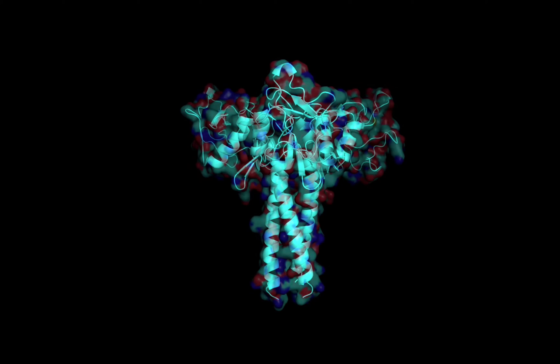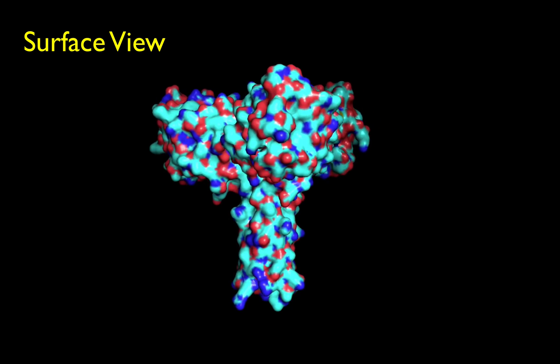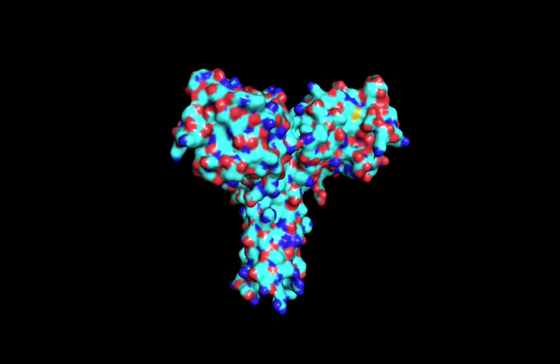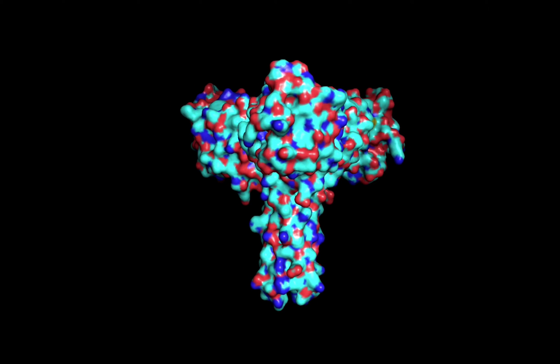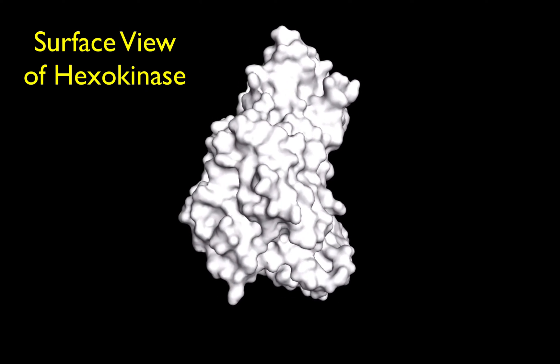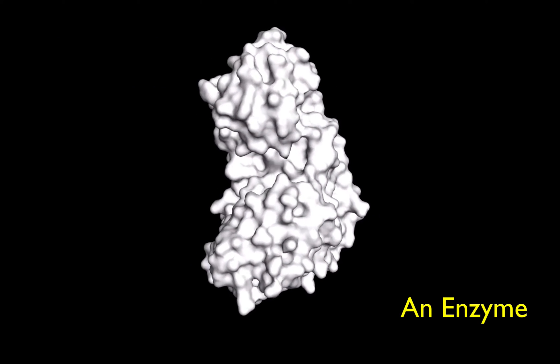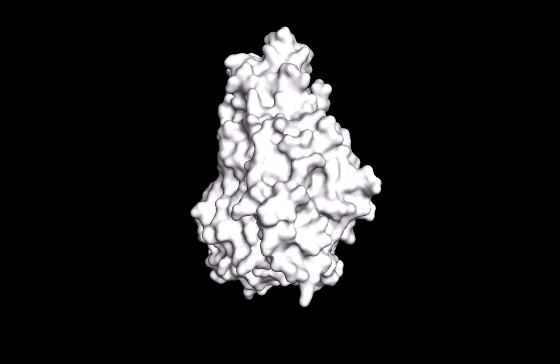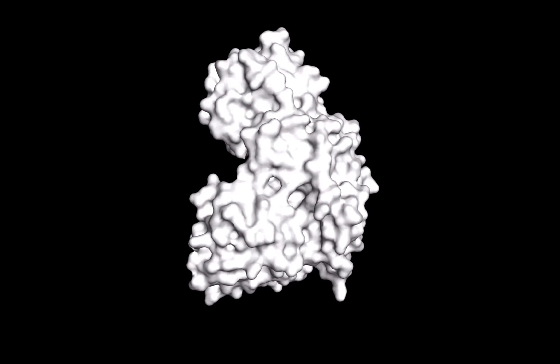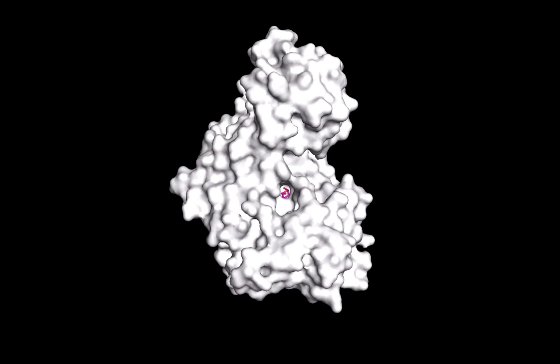Another very common way to render a protein is by showing the surface. This traces the outside edge of the protein. Notice in some spots on this protein there are little holes where there are no amino acid residues, and this makes a gap. Let's look at an enzyme in the surface view. Here we're looking at hexokinase, the first enzyme involved in the process of breaking down sugar in your body. Because this is an enzyme, it catalyzes a chemical reaction in a region of the protein called the active site, and this one does so in a deep cleft on the enzyme. Can you spot the active site?